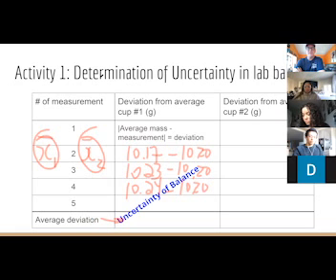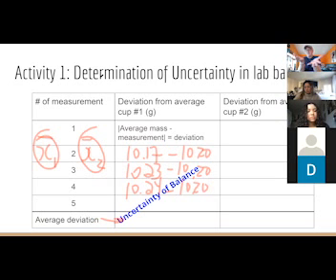Would you expect your deviation of cup 1 and cup 2 to be the same or different? Different. Why is that? Because maybe the amount of plastic used in each cup is not the same. Now, the mass would be different. Yes, I totally expect the average mass to be different. But do you think the deviation will be different? It's the same. That's what I think. I mean, obviously we need to do the experiment, but that's what I would predict. Because the deviation doesn't come from this, does it?